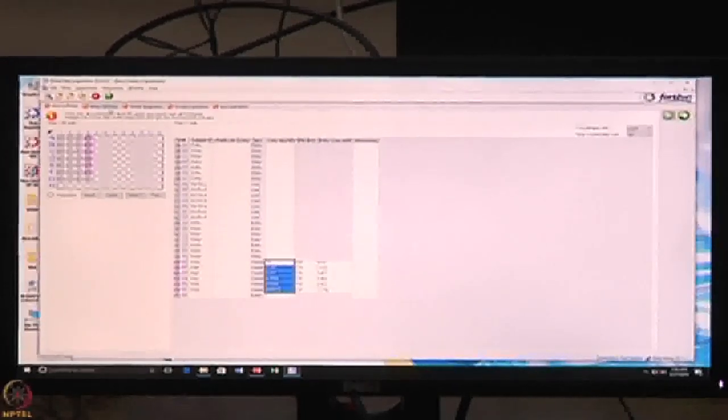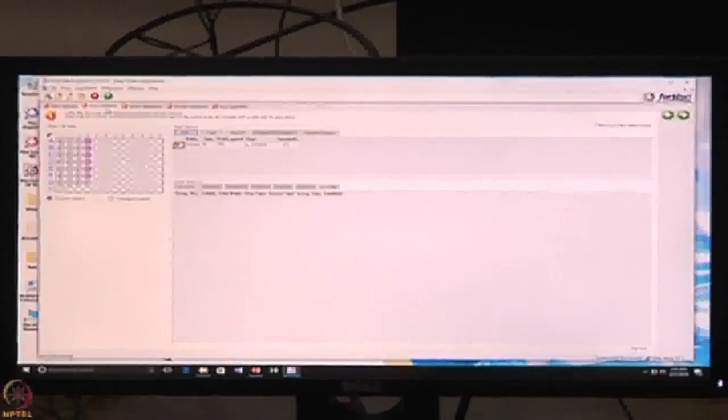The next is the assay definition. We fed in the plate, but we have to tell the software that this is the first step, this is the second step. You have to assign that, and only then does the instrument move according to the respective wells. So what information do we have to feed in here?